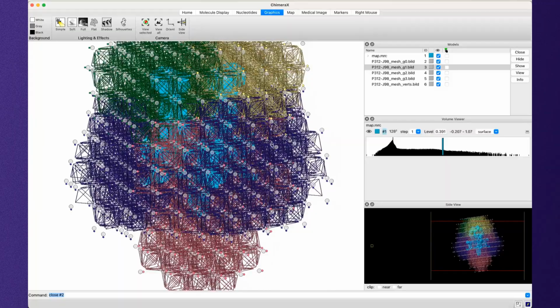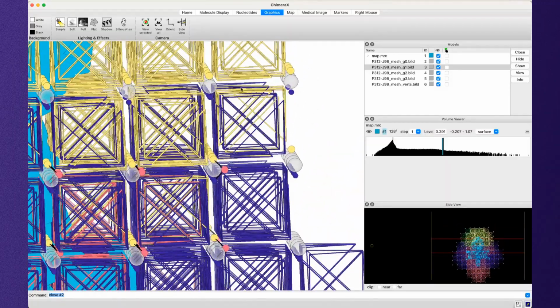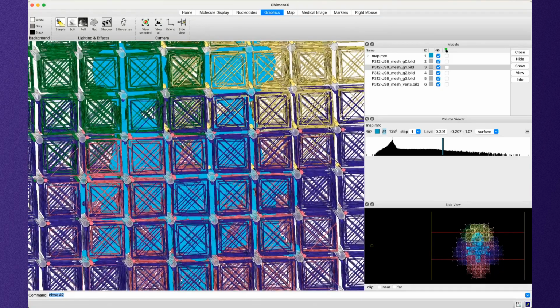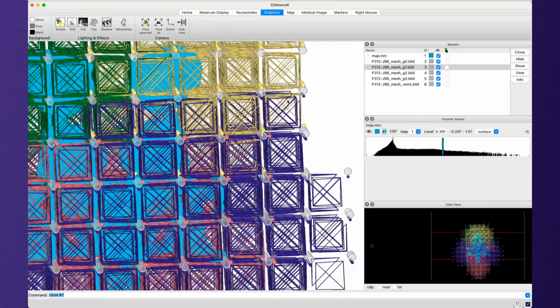surprising based on the biochemistry, right? We can see that the micelle here overlaps with this fab. And so maybe you mark the micelle as rigid, but fuse it to the fab instead. And then you fuse the fab to the transmembrane domain, and then the transmembrane domain to this other fab. And that would give you the same relative topology in the ion channel and fabs, right? Where the fabs would each be fused to the ion channel, but not to each other. But the important thing is the micelle will be fused to this fab here.